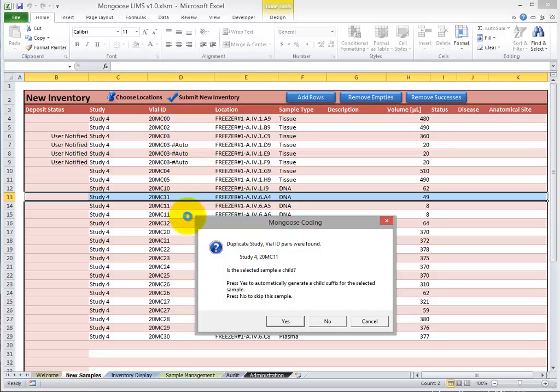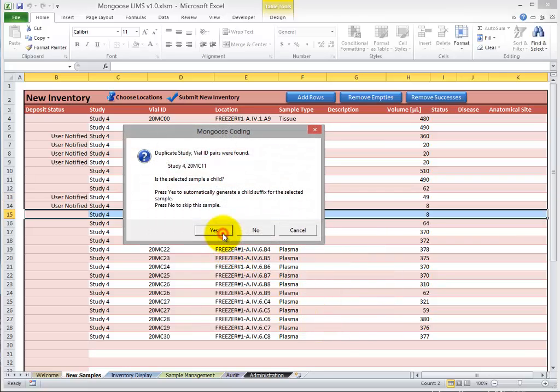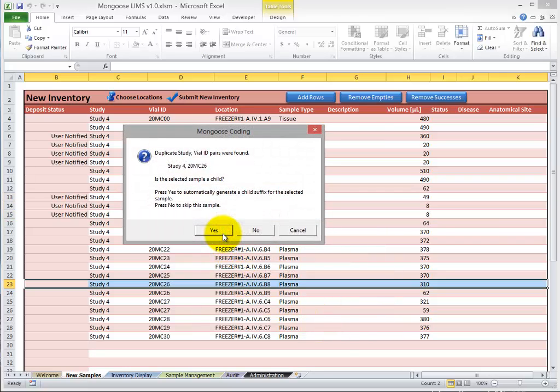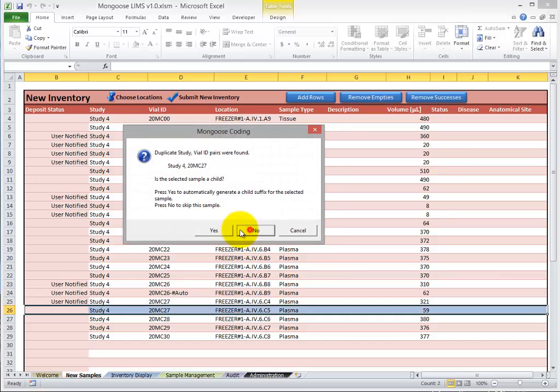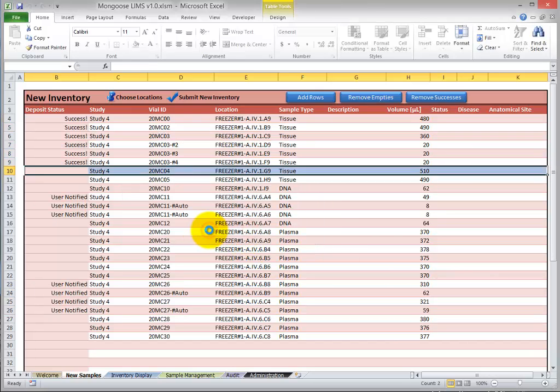Now the same thing's happening down here. We have three duplicates for 20MC11. And again, the first one looks like it's the parent. So we'll click No and then Yes, Yes. Same thing down here, 20MC26, No, Yes, No, Yes.